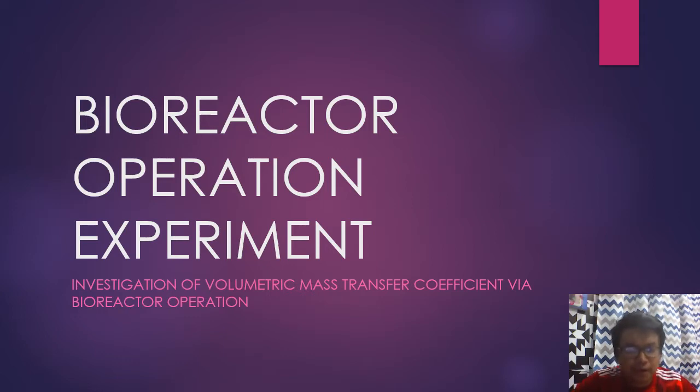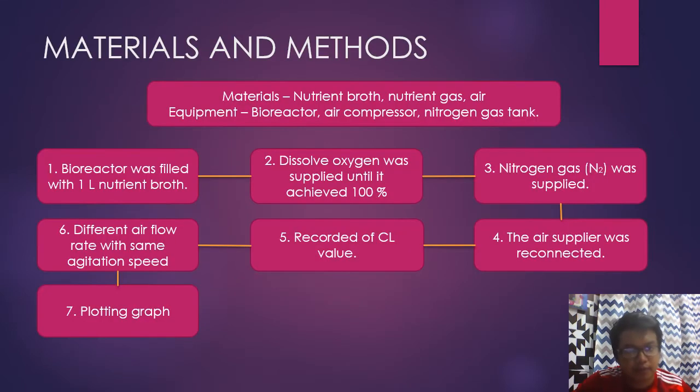Today I will explain about the experiment in the subject of bioreactor operation, which is the investigation of volumetric mass transfer coefficient via bioreactor operations. First and foremost, we go to the materials and method.